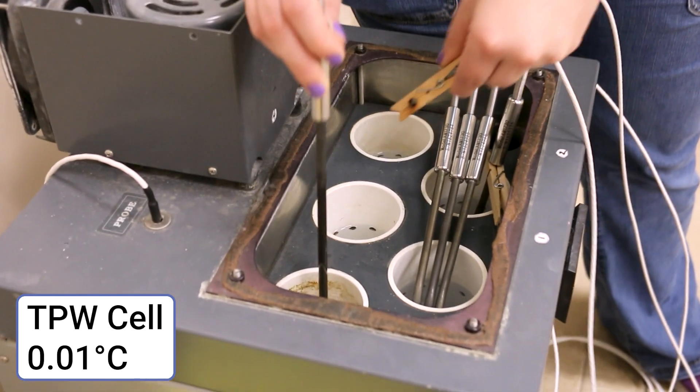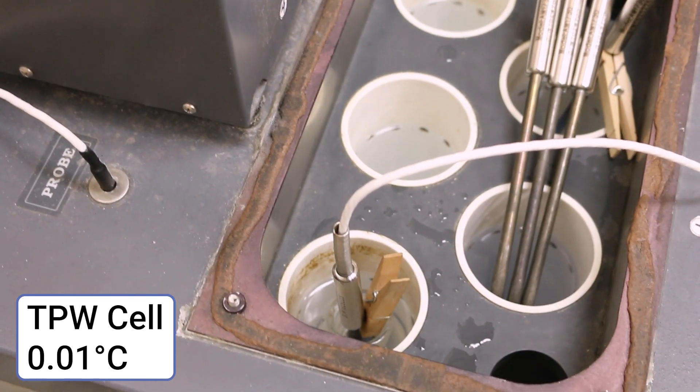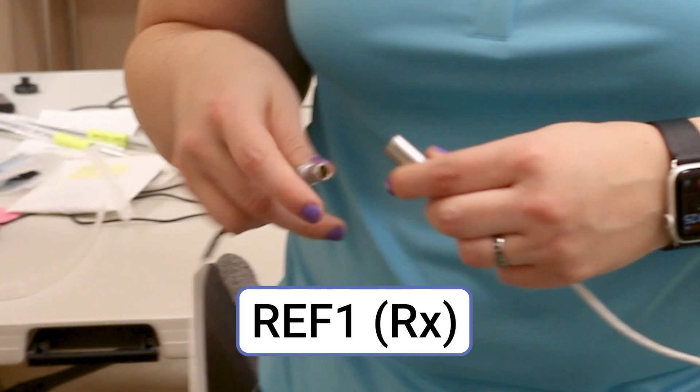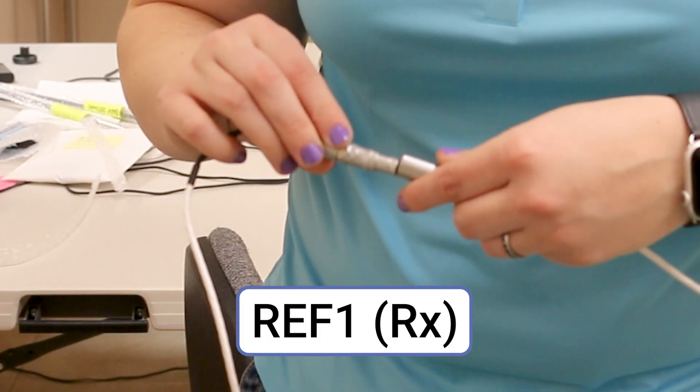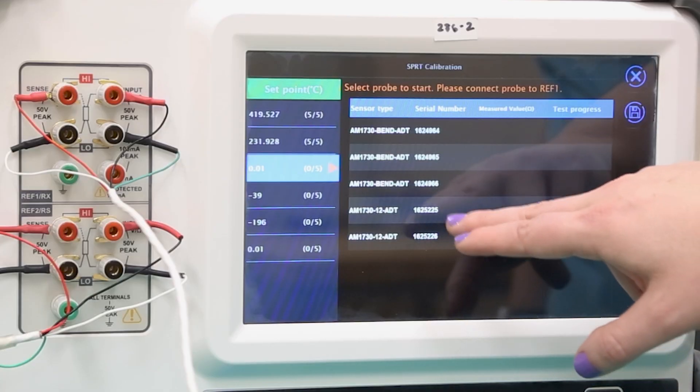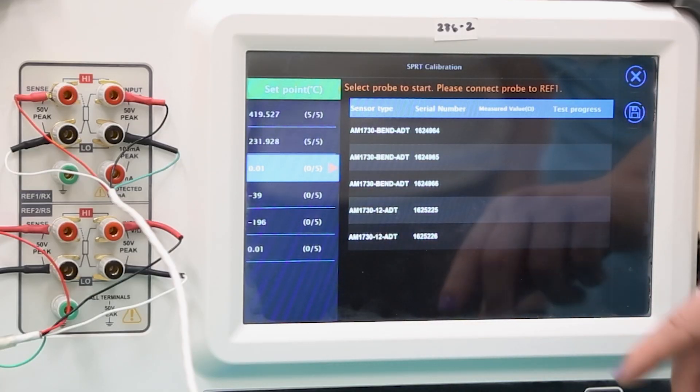For this set of measurements, we'll start with the straight probes first. Move the active probe into the water cell, then connect the cable to the four wire connection on REF1. On the 286, select probe 4 from the menu to begin measurement.